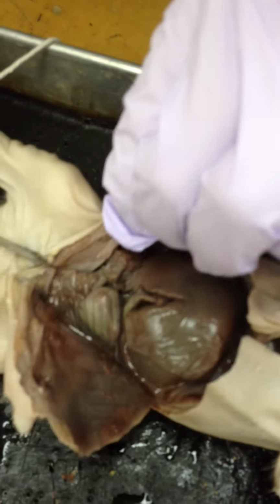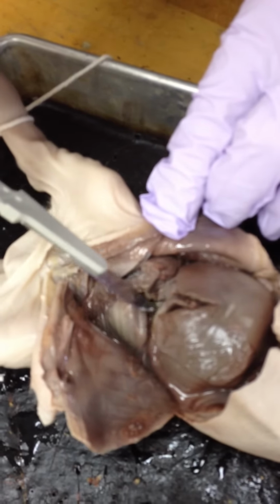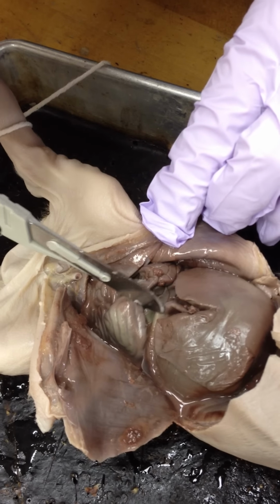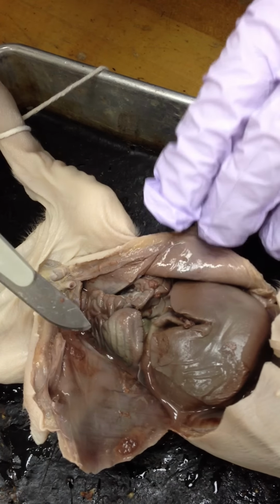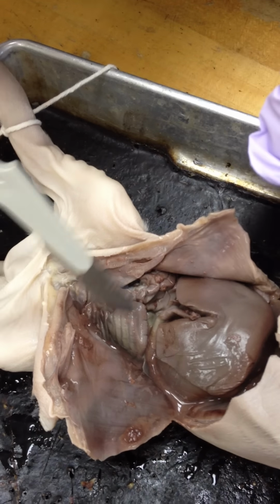Slice some more. See, this is all the small intestines and the large intestine. That might have been why there's some goo here. The stomach, you mean? No, the stomach's up here. I think this might have been the large intestine. I may have punctured it, in which case this is all just waste.